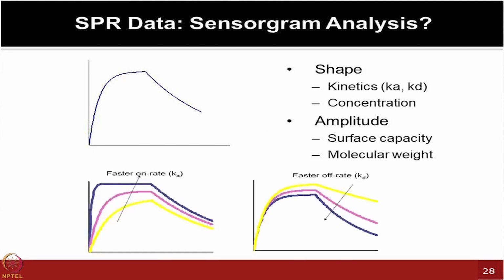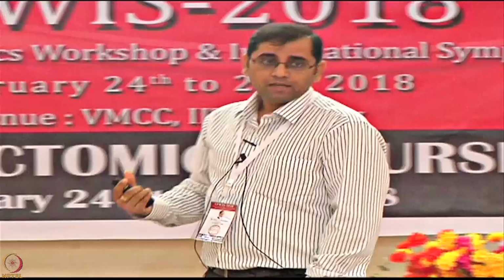And many times these kinds of curves, which show you just the difference in the on rate and off rate, can be very powerful, because imagine that you are working toward developing different drugs. An objective for those drug developments, probably you might have quoted several examples. If you want to really make that drug work very fast, right? You want immediate effects for any accidental condition, any kind of headache kind of thing.